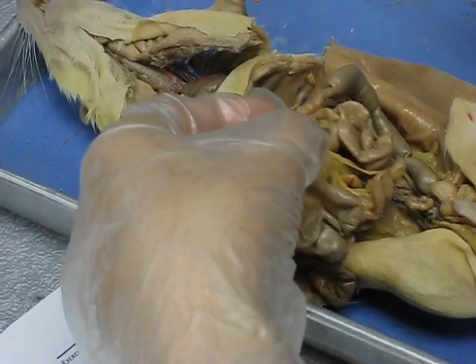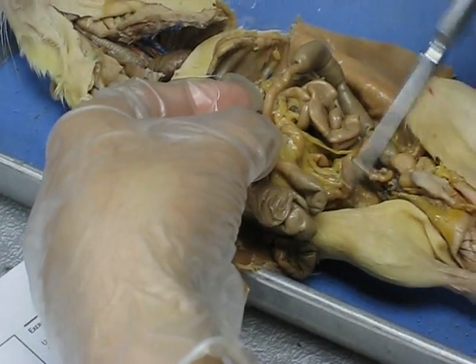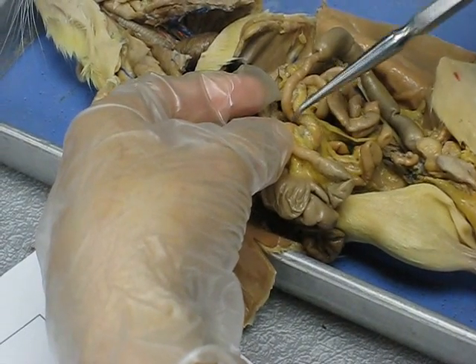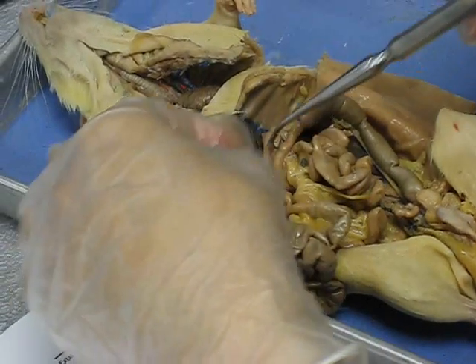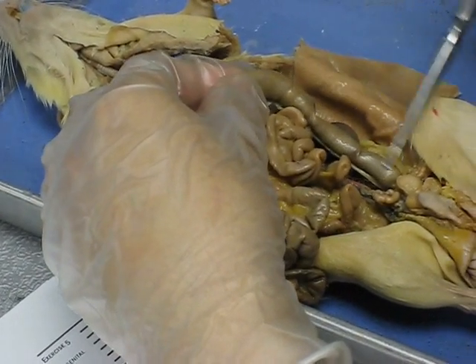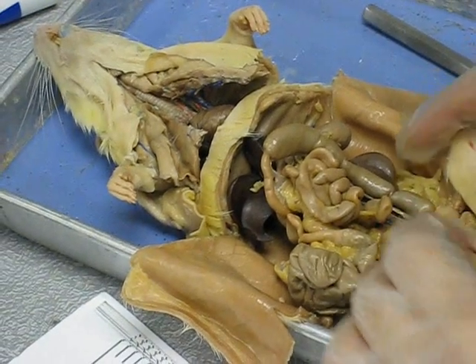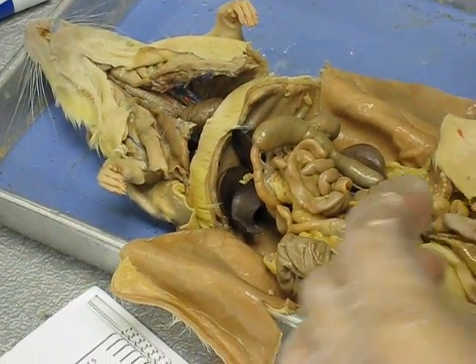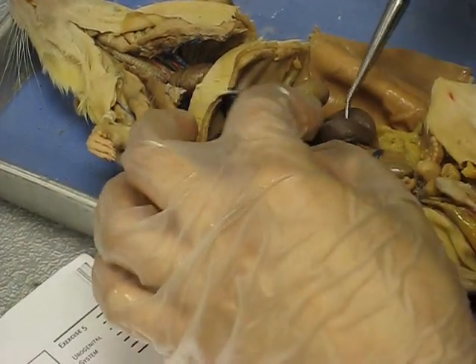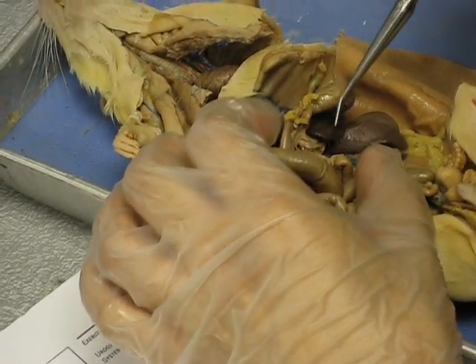There are three parts to the large intestine — you may not need to know these this quarter: the ascending, transverse, and descending. The ascending connects to the cecum, the transverse comes across, and the descending comes down. Then we have the colon here — looks like this guy had a good meal before he died. There's the colon. And then here — what's this little tongue-like organ? The spleen.